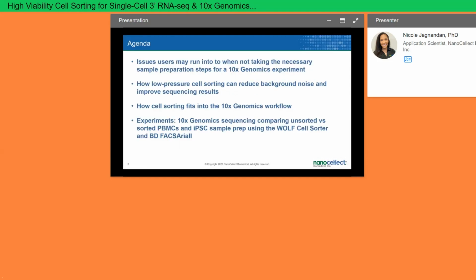During this presentation, I will be talking about the issues users may run into when not taking the necessary sample preparation steps for a 10x Genomics experiment, how low-pressure cell sorting can reduce background noise and improve your sequencing results, how cell sorting fits into a 10x Genomics workflow, and then finally, I will be going over the results from two 10x experiments we did, comparing unsorted versus sorted PBMCs, and another 10x experiment with stem cells using the Wolf cell sorter and the BD FACSAria II for sample prep.